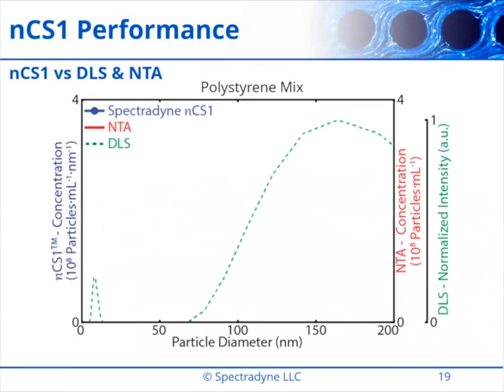If you pretend you get a DLS measurement on some kind of formulation that looks like this in green, you would say, well, I got a peak in my distribution around 170 nanometers. In this view, it looks pretty broad. Actually, if you plot this in log scale, it looks pretty narrow. So great. We have a nice particle size peak. Maybe we want to get a higher resolution view, so we move to NTA.